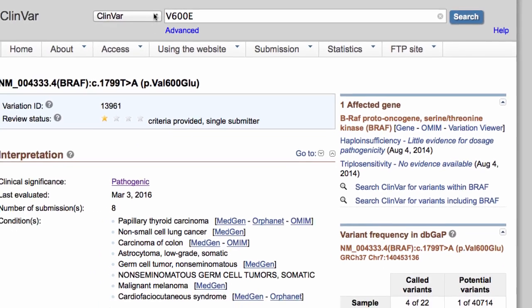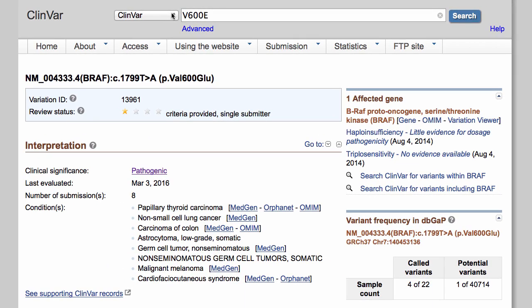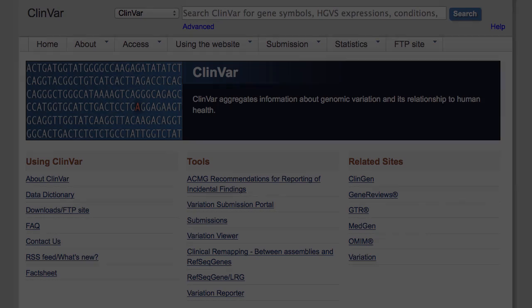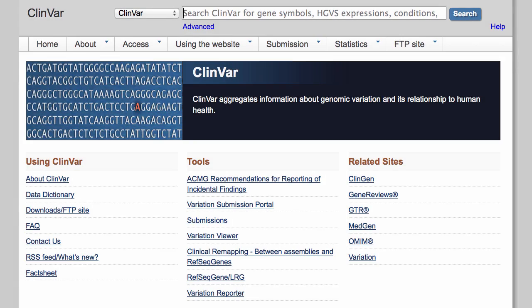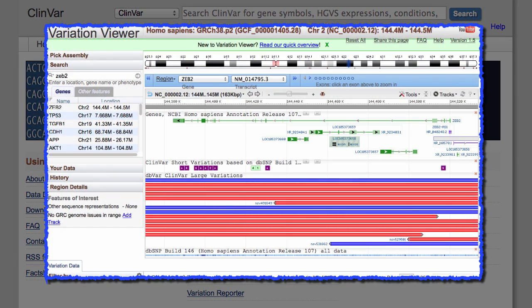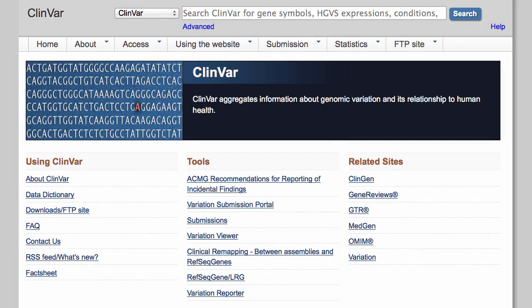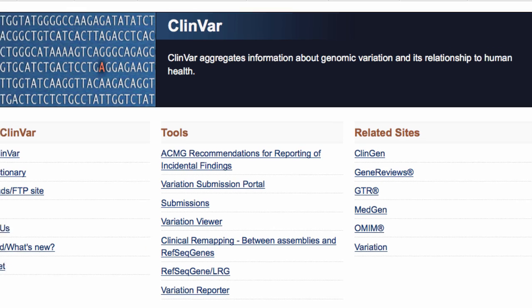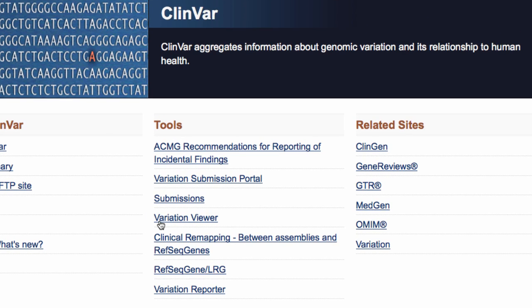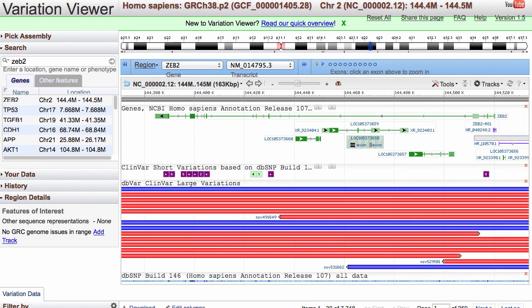A third scenario is finding variants within a specific genomic region. You might be interested in structural variants in a certain cytogenetic region, or affecting a certain gene, or in sequence variants in a particular exon of a gene. The most convenient way to search for variants in a genomic region is within the Variation Viewer, a genome browser for variation information at NCBI.